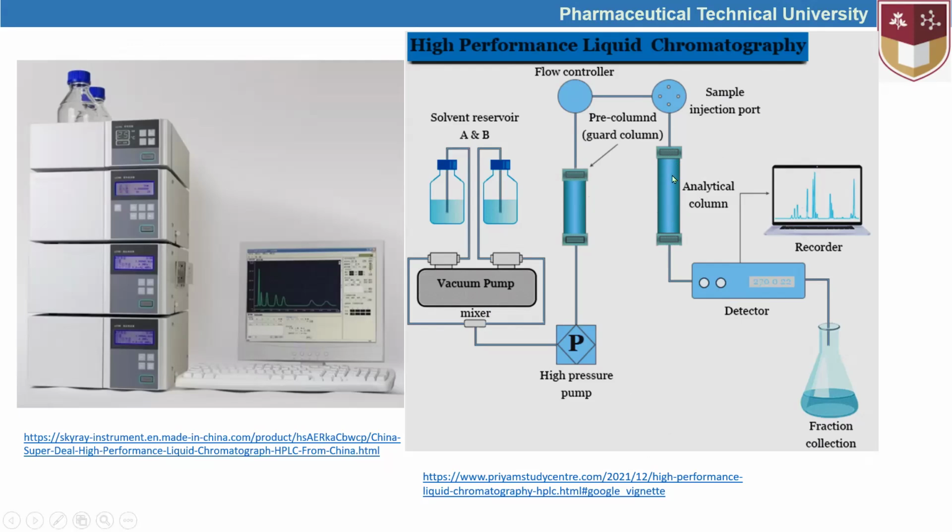When the compounds are separated, they are identified and quantified by using different detectors. We are going to talk about detectors and other tools a bit later.